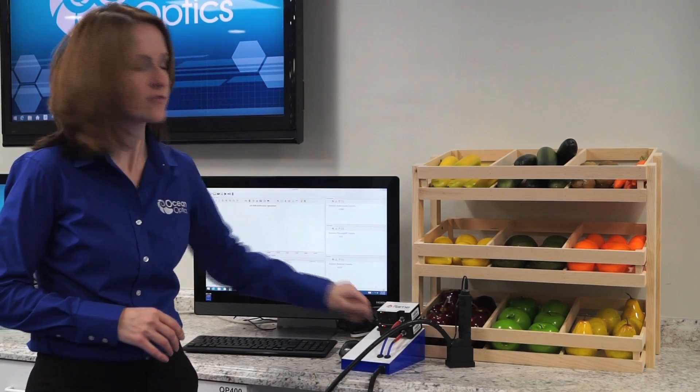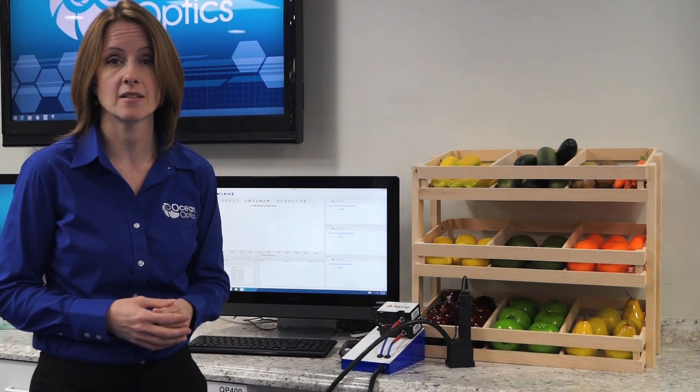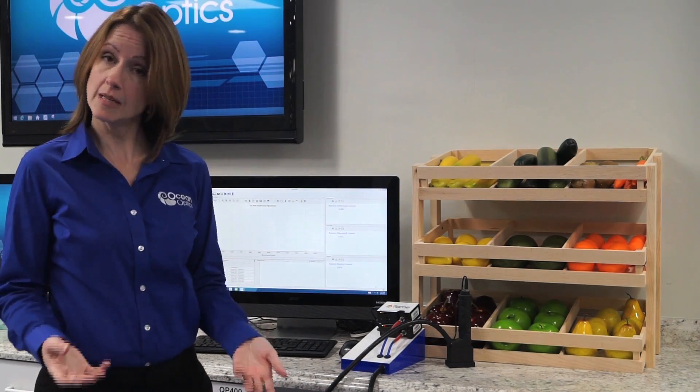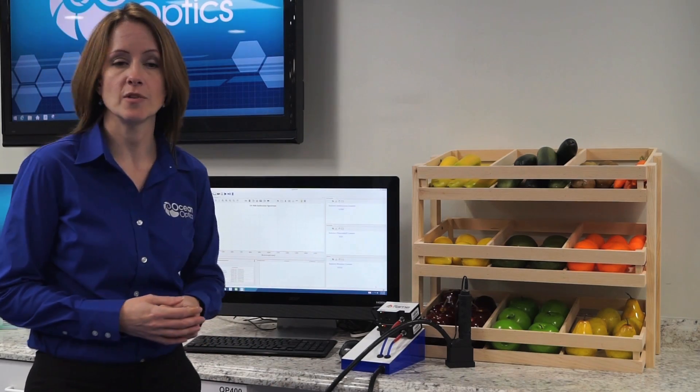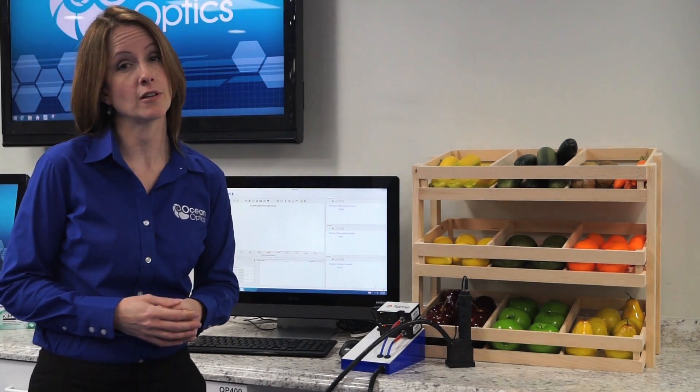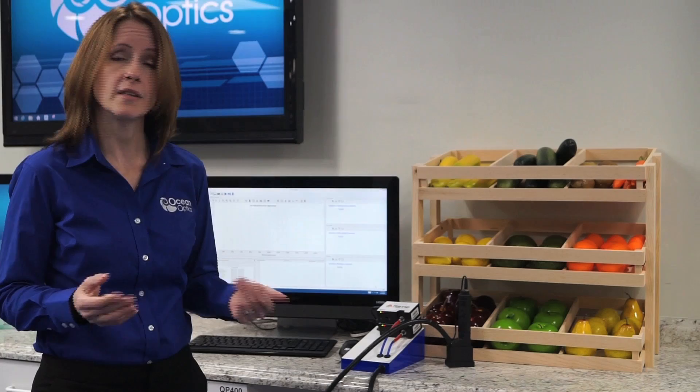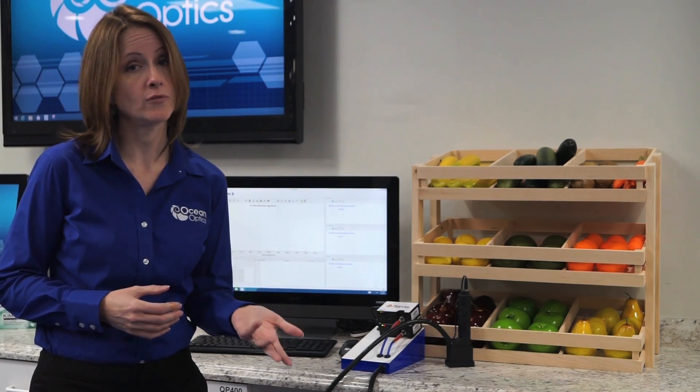Our Flame-NIR spectrometer looks at near-infrared light from 900 to 1700 nanometers. Near-infrared light probes deeper into the tissue of the fruits and vegetables, allowing you to look at things like sugar and moisture content, or, in the case of soybeans, at the ratio of oil to protein.